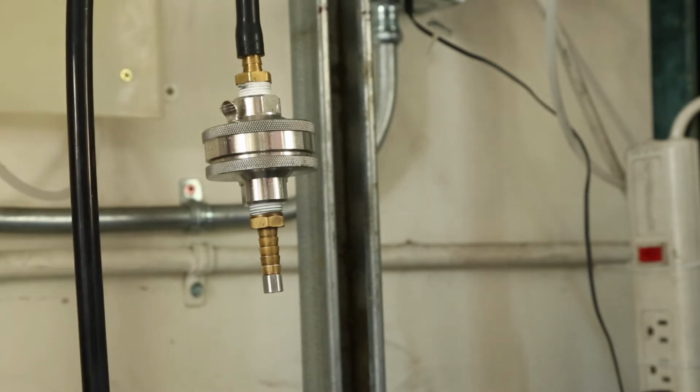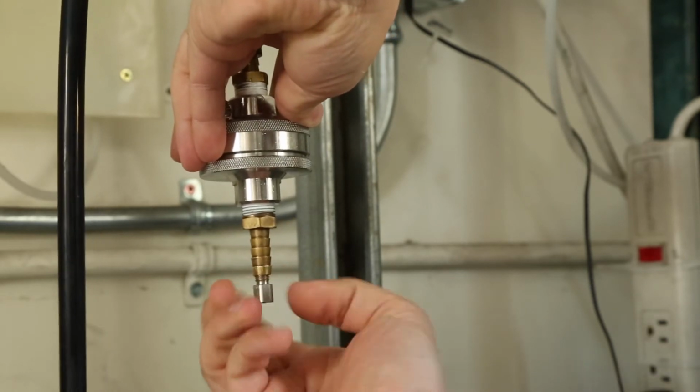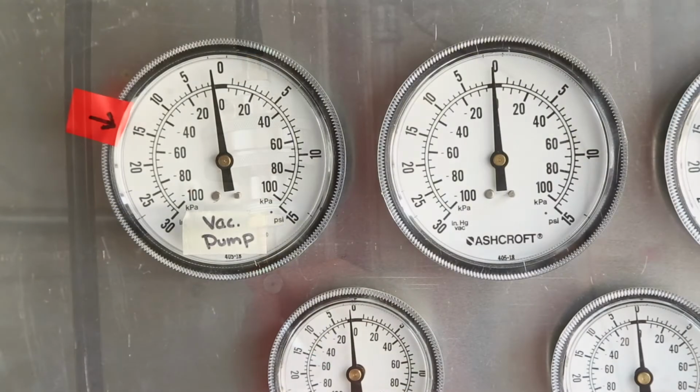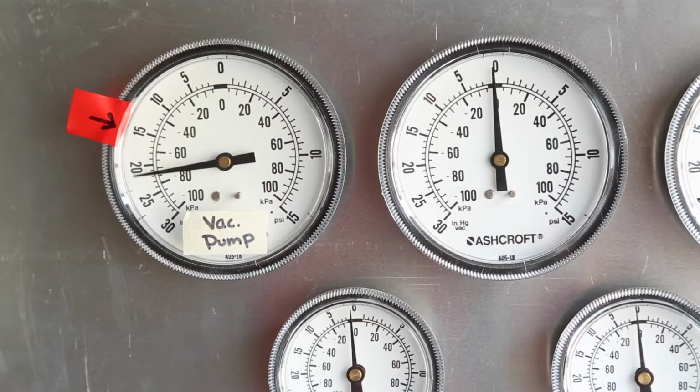Our critical orifice is designed to thread into the barb at the outlet of our filter holder. When a critical vacuum pressure is reached downstream of the critical orifice, supersonic flow will pass through the orifice. In this shot, you can see a pressure gauge monitoring the downstream pressure of our critical orifice, with the critical pressure marked with red tape. Once the critical pressure is reached, the flow through the orifice is supersonic and the flow is choked.